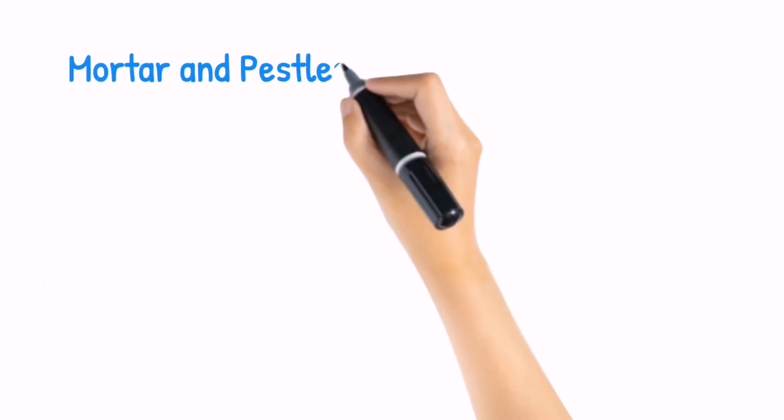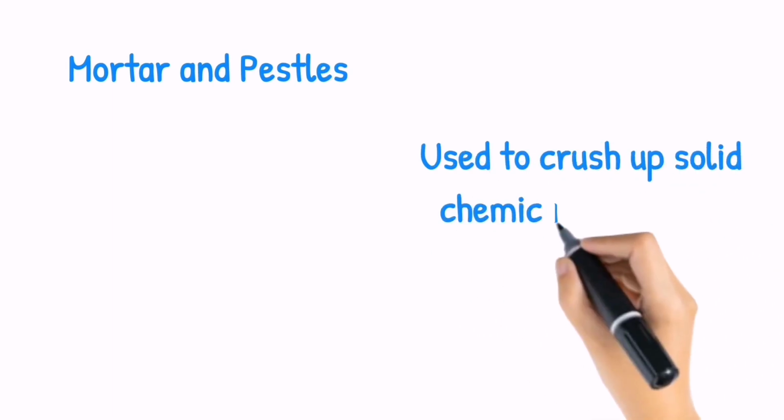Mortar and pestle, used to crush solid chemicals into fine powder.